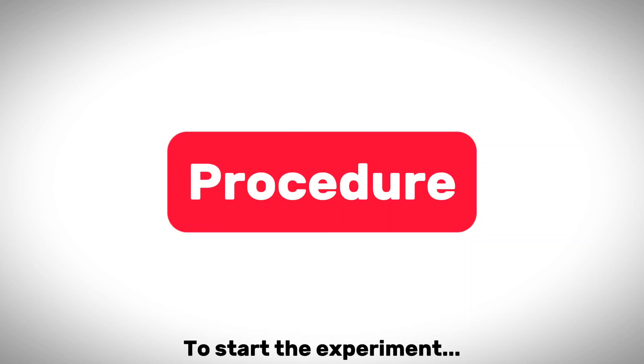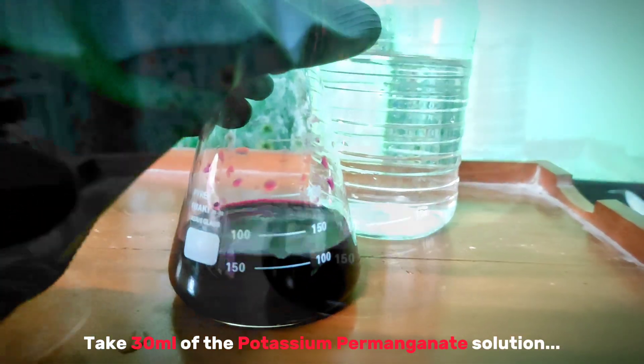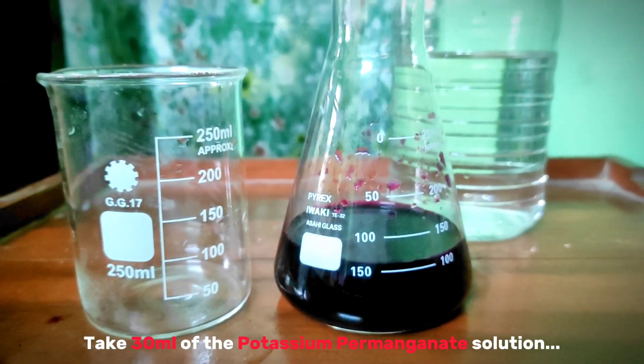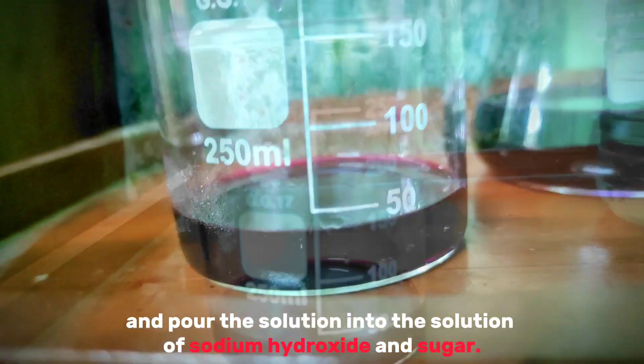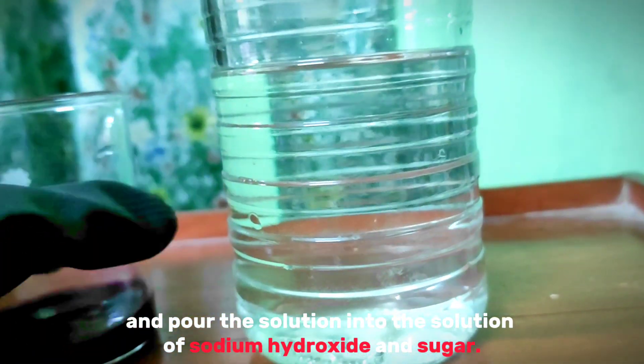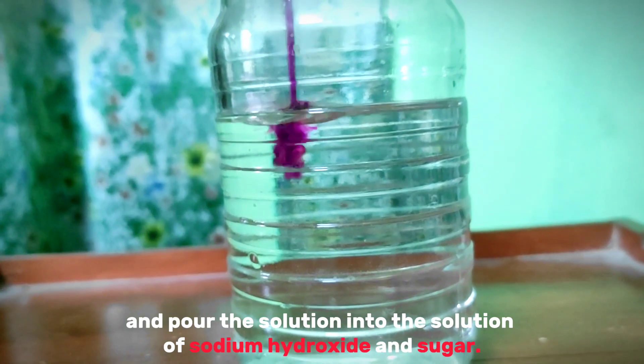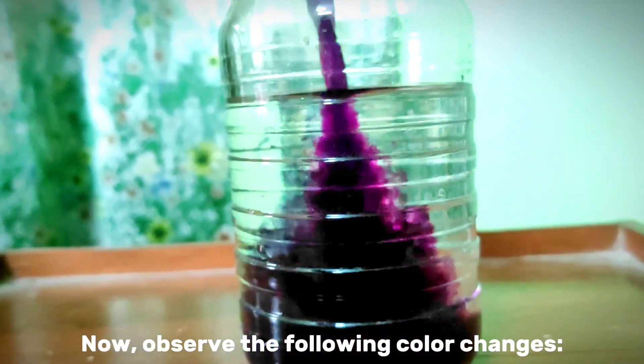To start the experiment, take 30 ml of the potassium permanganate solution into a beaker and pour the solution into the solution of sodium hydroxide and sugar. Now observe the following color changes.